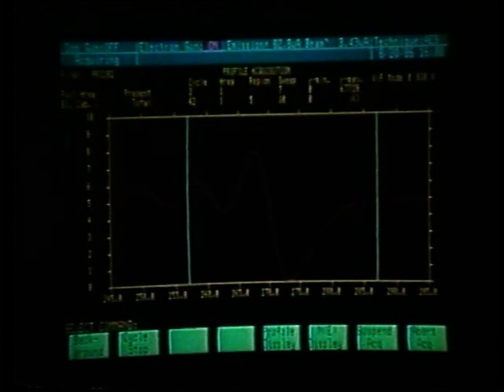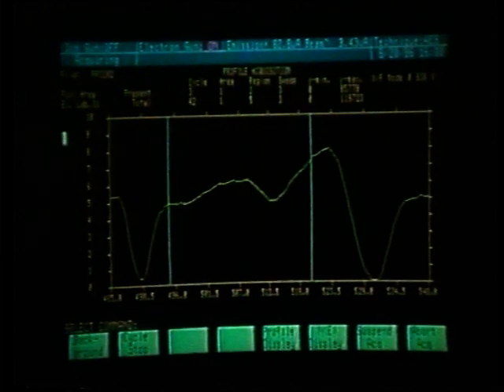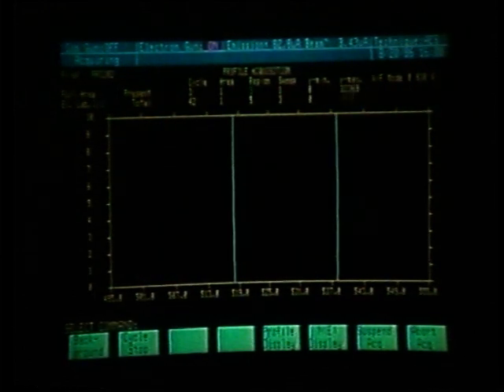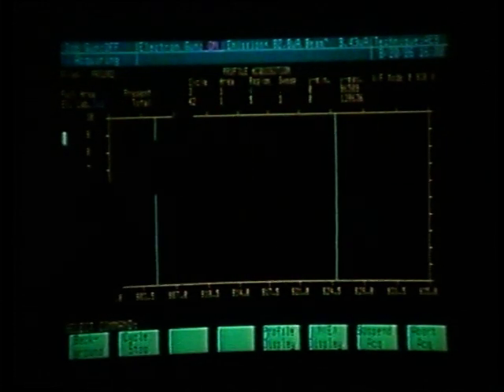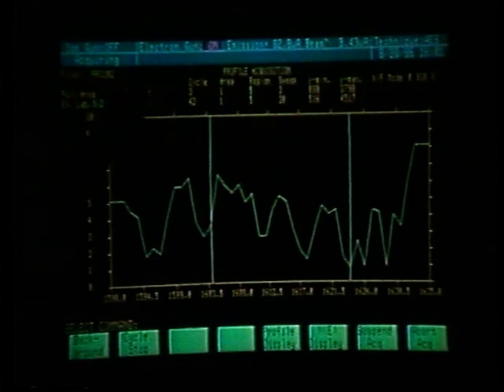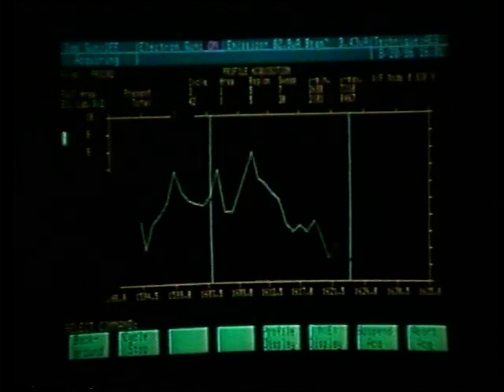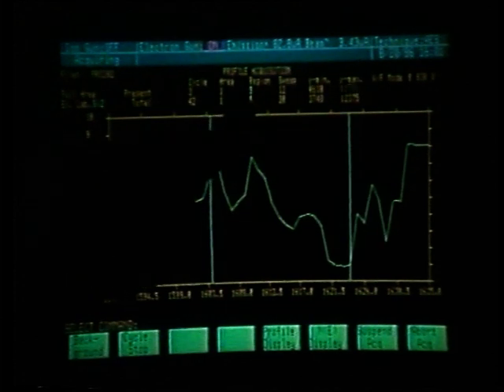We have now begun sputtering. This is now our 3rd cycle. We go 2 full cycles before we actually begin sputtering. That is our pre-sputter data information. We are now on cycle number 3 out of 42 cycles. To go 20 minutes, as we mentioned, would be 40 cycles with 2 cycles for the pre-sputter. That is automatically then figured in, so we will go a total of 42 cycles. We are right now on cycle number 3, and we are monitoring region number 5.